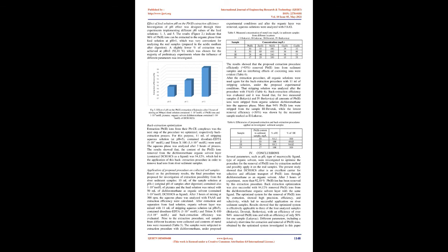Effect of extraction time. The duration of mixing is an important parameter for every extraction procedure. Different experiments were designed to investigate this effect, using 50 ml of organic solvent phase mixed with 10 ml of aqueous feed solution phase. The results, Table 4, showed that after 3 hours of mixing, maximum extraction efficiency was achieved, 92.10%, so this extraction time was chosen for the final procedure.